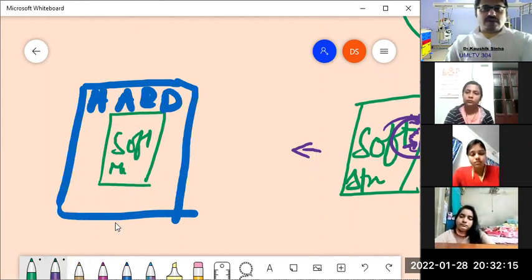So if I now place the edge of my knife or the chopper out here, the chopper being very sharp and the surface on which the chopper is in contact very hard, there will be almost no deformation in this area that I'm putting the dots on.